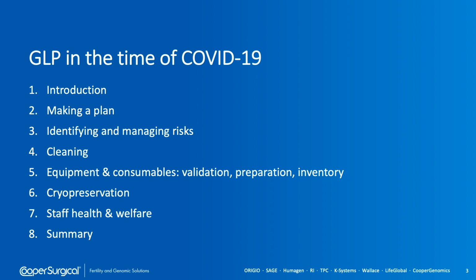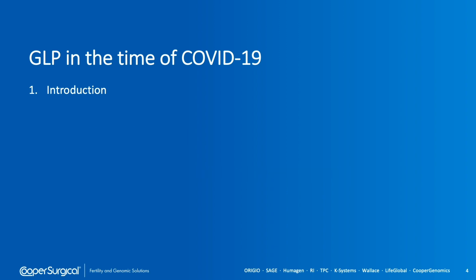This webinar covers how to improve good laboratory practice as a means of reducing the risk of infection within the clinic, from planning through to maintaining staff health and welfare. In the introduction, I shall review what we are dealing with.